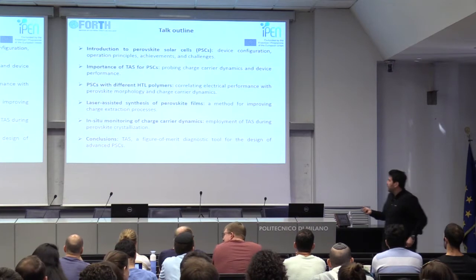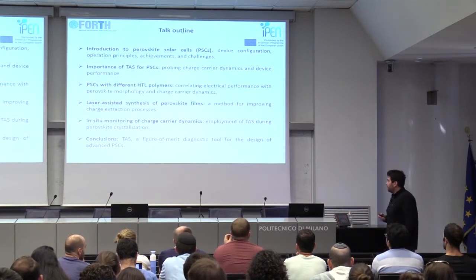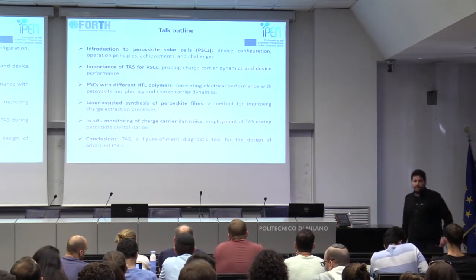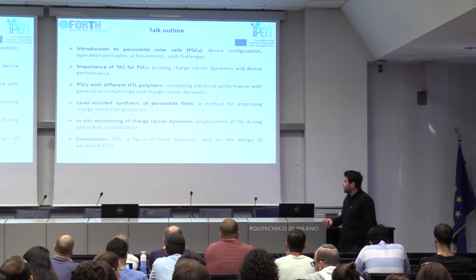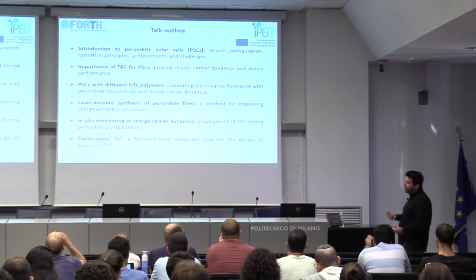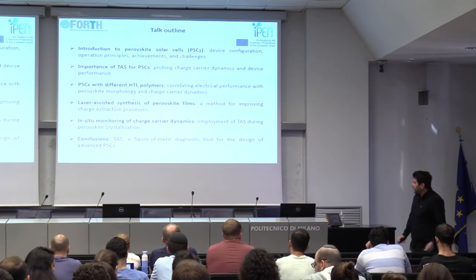Then I will talk about how TAS is important for studying perovskite solar cells and components for perovskite solar cells. And I will present 3 different examples. The first will be in perovskite solar cell devices that we employ different hole transport layer polymers. And I hope I will be able to demonstrate to you how we correlate the electrical performance with the perovskite morphology and the charge extraction dynamics.